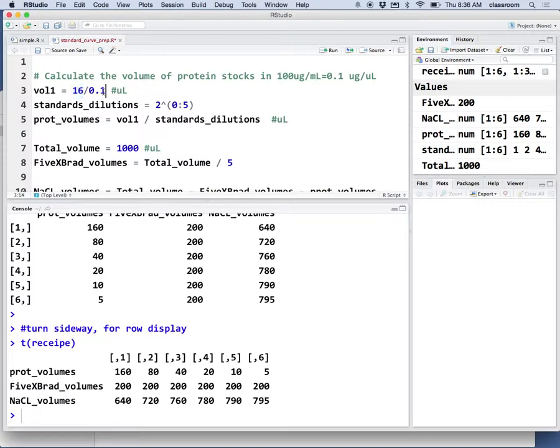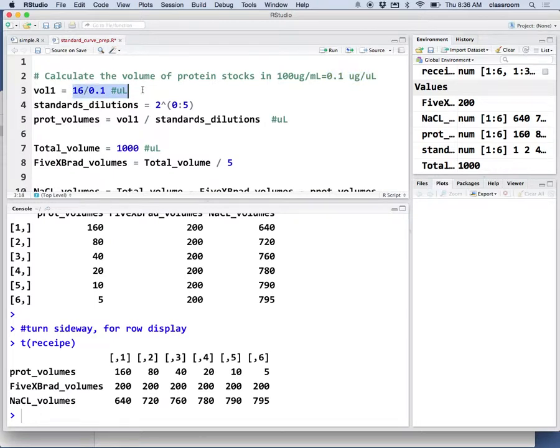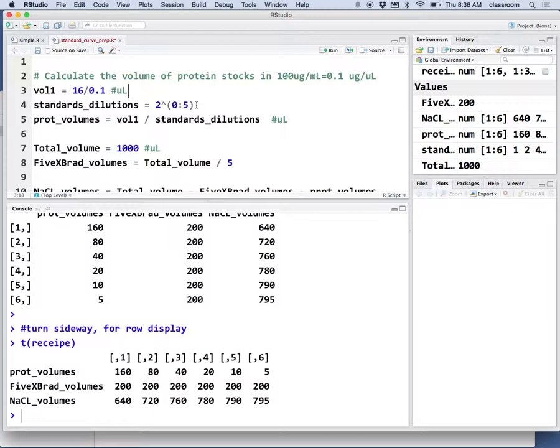We need 16 micrograms, and since the stock concentration is 0.1, we divide by 0.1 to get the volume for the first tube. For this standard curve, the recipe says 16, 8, 4, 2, 1, 0. How is that calculated?